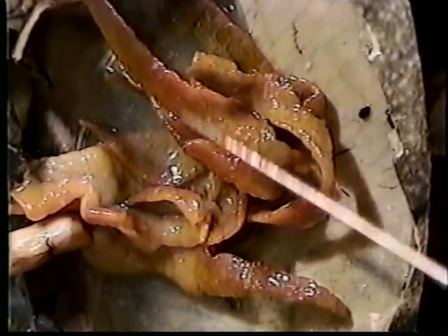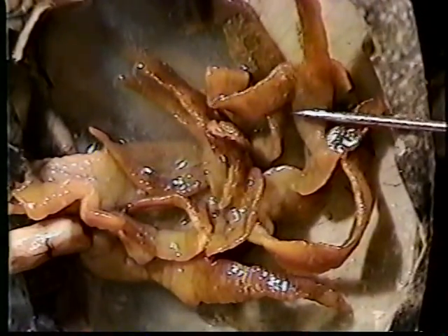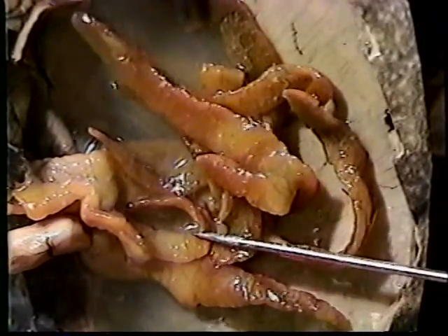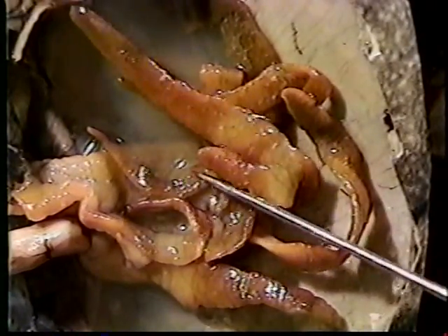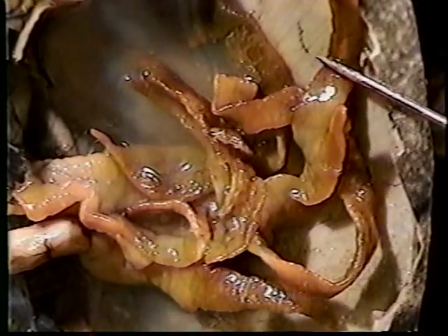Some of the other organs that you see nearby are fat bodies. Much like you and I, the frog stores excess glucose and nutrients as fat bodies.